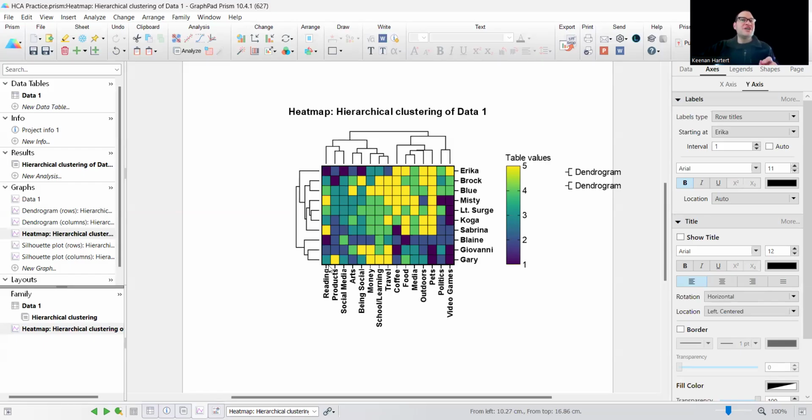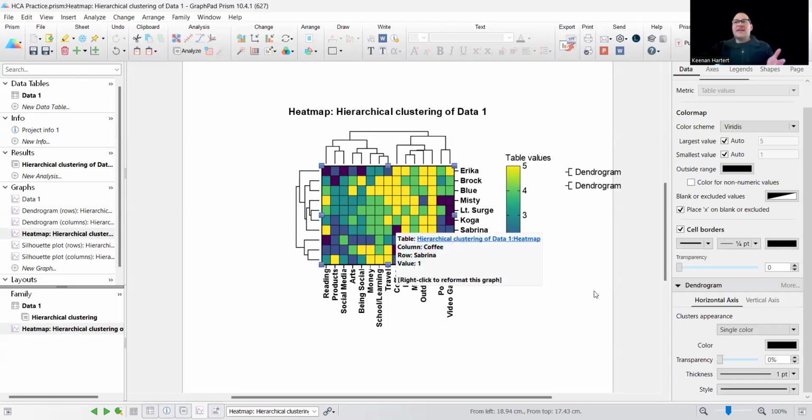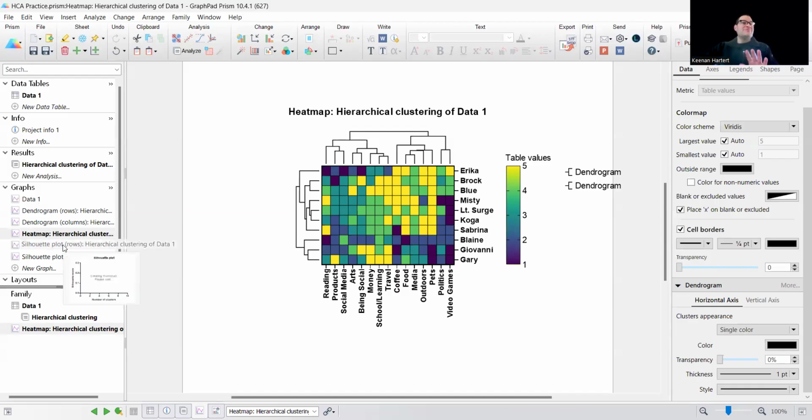Not going to judge. But what you can use this for is this massive, excellent use of how to show a ton of data in here. Really nice. Again, you can always do, like I say, I really like putting the value in the grid line or in the actual cell if it's not crazy, but we'll skip that for now.